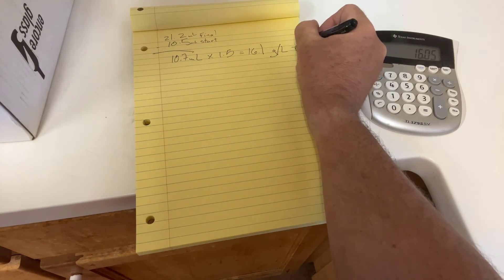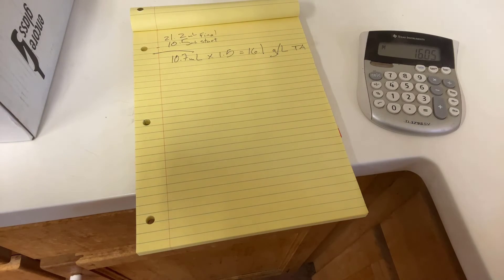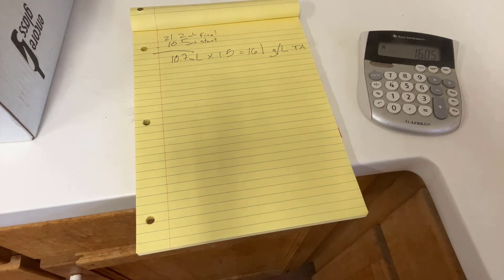Keep in mind in the U.S. we measure titratable acidity in tartaric acid equivalents. In Europe it's different. It's sulfuric acid equivalents. So they are not one-to-one. All right. There we go. Easy peasy.